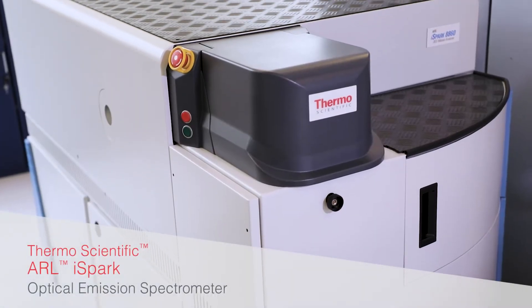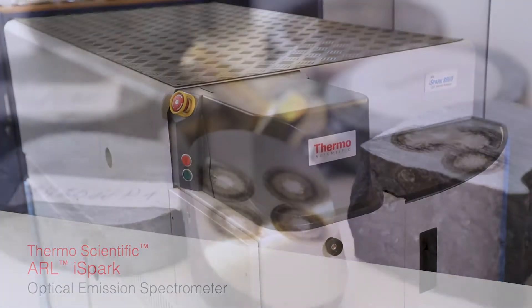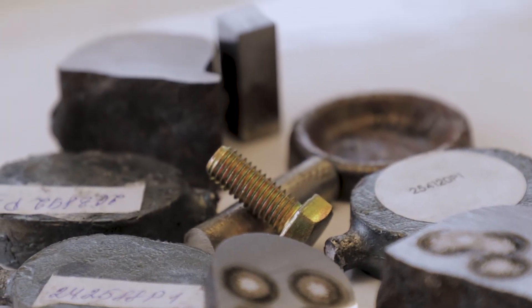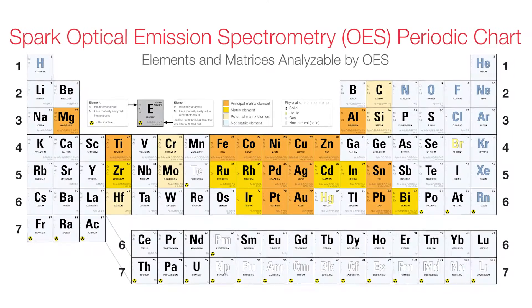Spark Optical Emission Spectrometry, or OES, is the most widely used technique for fast elemental analysis of solid samples of a large variety of metals and alloys.